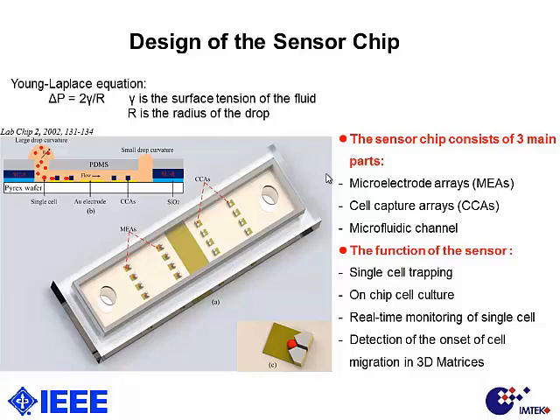The microfluidic channel is produced by aligning a PDMS on our chip to produce the inlet and the outlet. In our chip, we integrated a method called passive pumping, which utilizes the Young-Laplace equation.